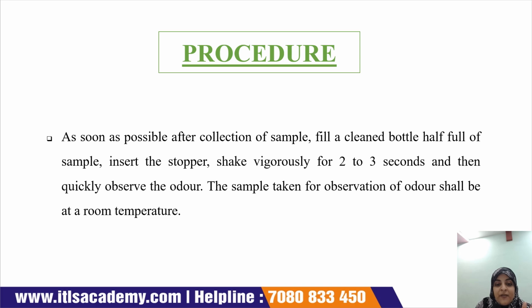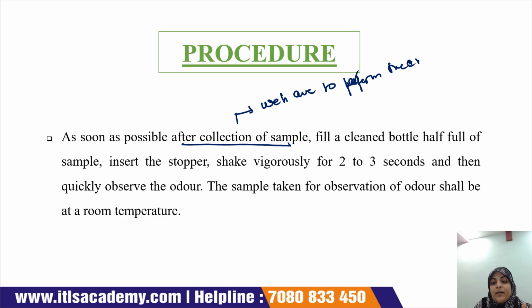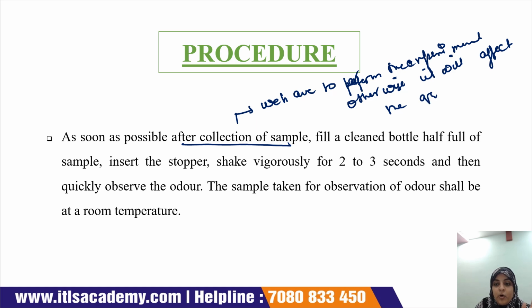As soon as possible after the collection of the sample, we have to perform the experiment, otherwise it will affect the odor quality of the sample.